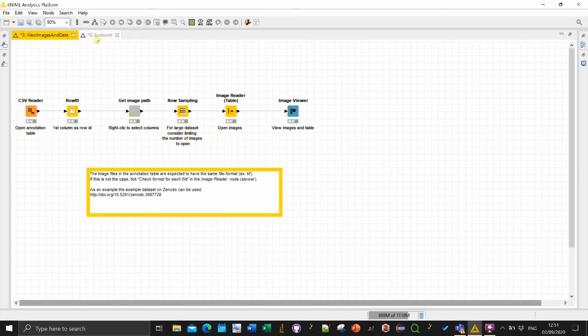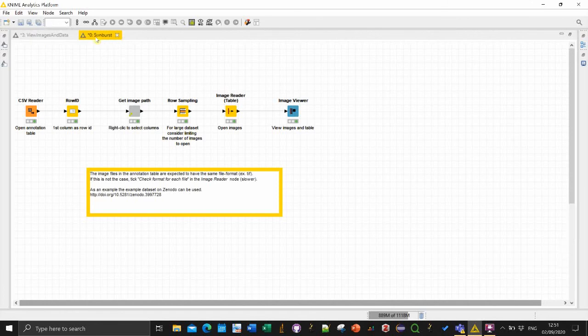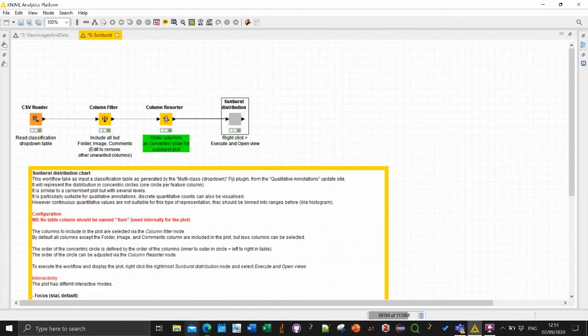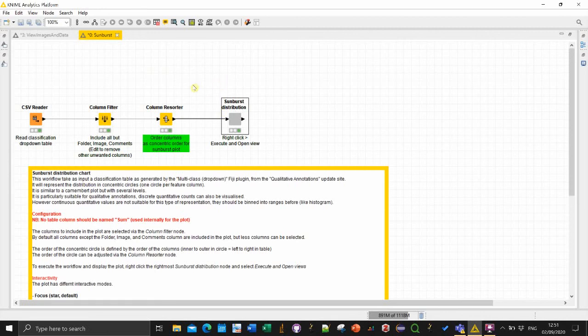Then I will go on with the second workflow which is slightly more complex, which is about generating the sunburst plots to visualize the distribution of your qualitative features. You can have a look in the article for more detail.